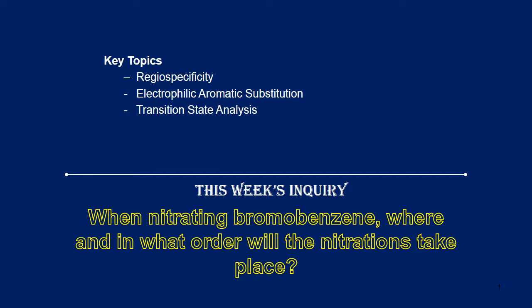So, without any more delay, let's get right to the question for the week. The question for the week is, when we use electrophilic aromatic substitution to nitrate bromobenzene, where and in what order do we expect these nitrations to take place? By the end of the week, we will have experimentally confirmed the location and the order of nitrations in this reaction.